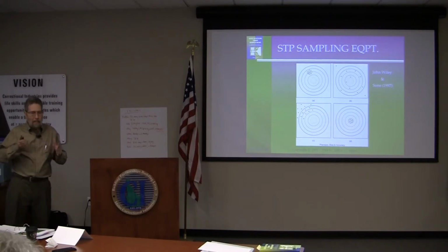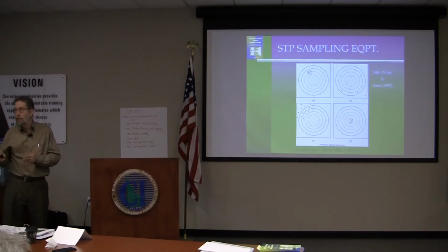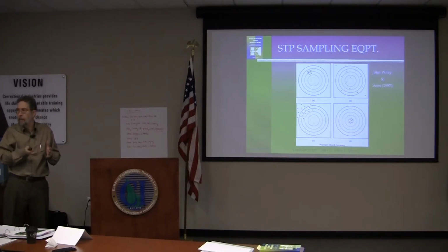And you test them, and some of them are good and some of them are not so good. So when you compare your process with this reference material, it may say you're doing badly, but it may be their fault. And that doesn't necessarily mean you're doing well, but with others, if it says you're doing well, you really are, and if you're doing badly, you really are too. So bias is tough.